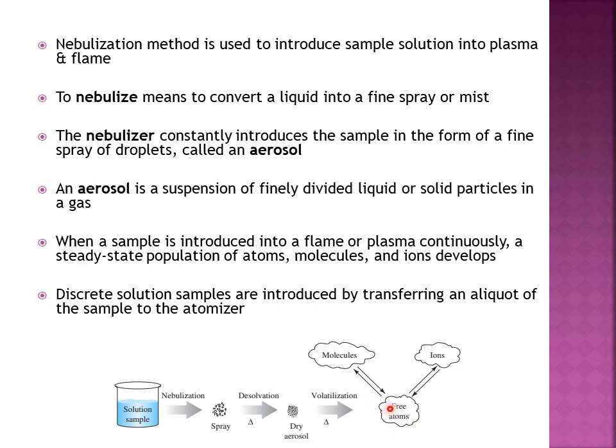These atoms may rejoin together to give molecules, and further by getting heat, they might be decomposed again into free atoms, or these atoms may get sufficient energy equal to their ionization energy, so they may remove one or more electrons and be converted into ions, and these ions, by getting the electrons back, might be converted into free atoms. And remember, in atomic spectroscopy, we are interested in these free atoms only.